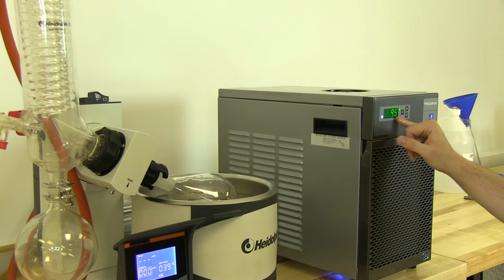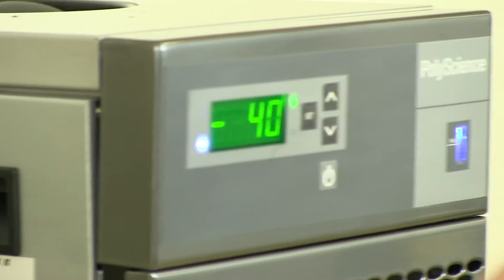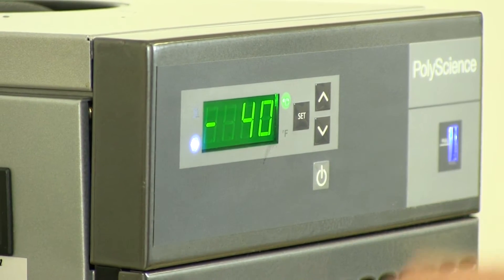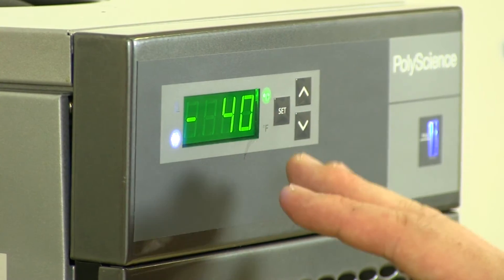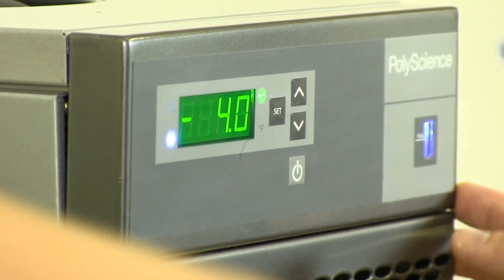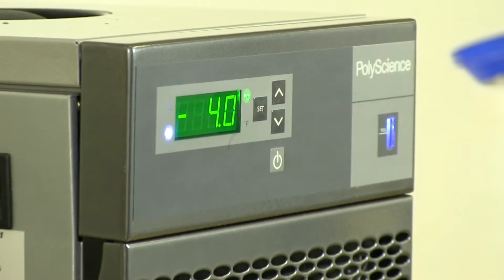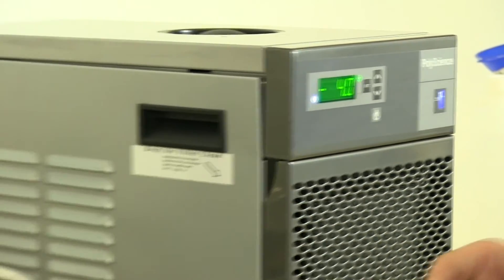Allow the unit to get down to temperature. It's at about 9.5°C right now, but we have it set for minus 4. Minus 4, minus 5, that's about the optimal distillation temperature as far as the condensation will go inside the condenser coil here and this whole distillation process.